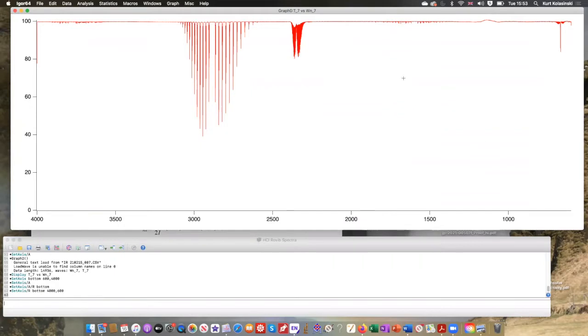All right, what's in here? There are a few different amalgamations, little peaks that are joined together. And some of these have some real patterns to them. This is just something out of the optics there. But we've got things with real patterns to them, right?